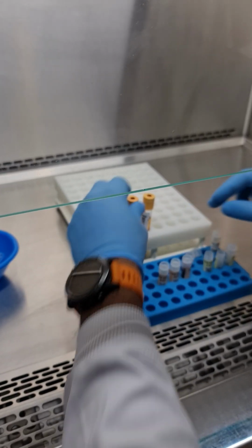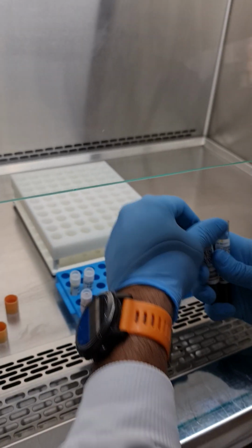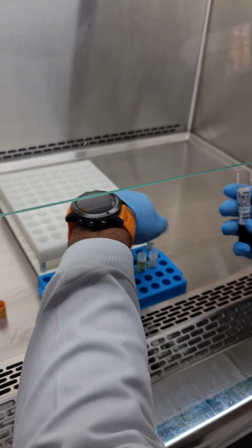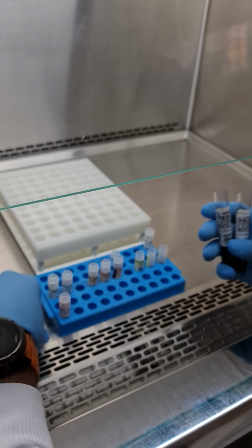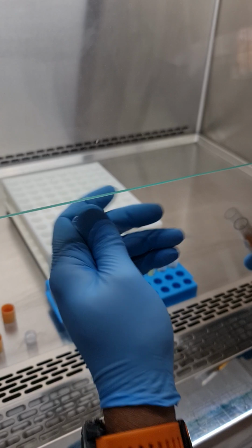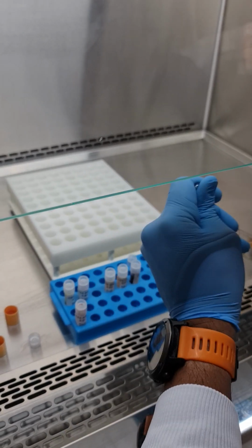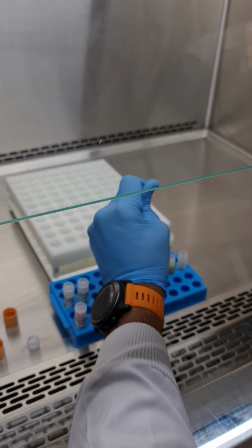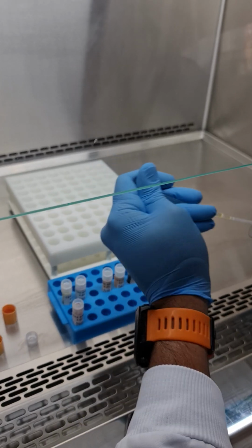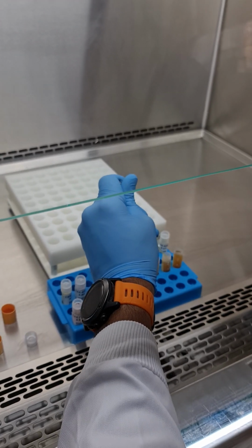Move to the next one, the SST tubes, corresponding numbers, suck the serum and pipette it in the cryotubes X1, X2 and X3.